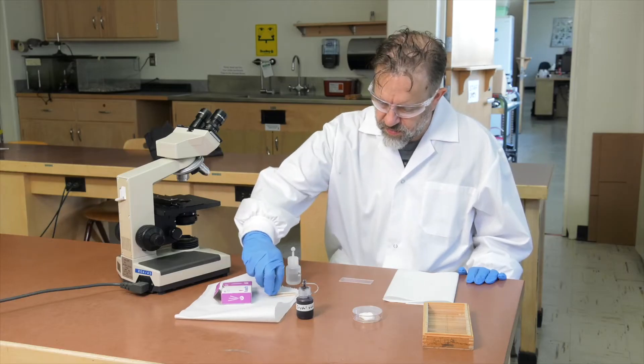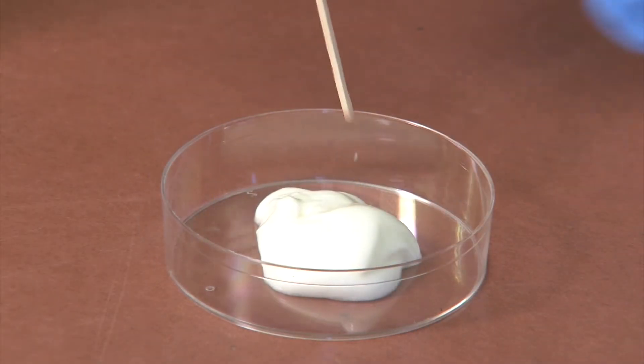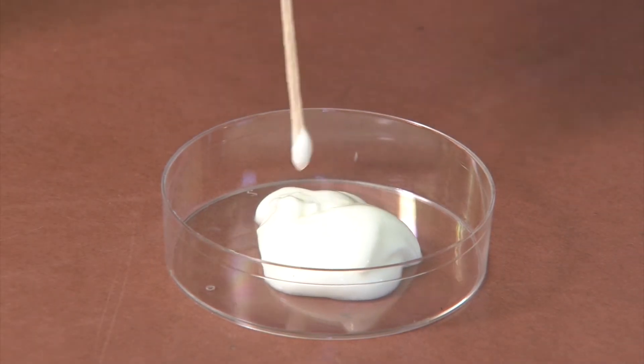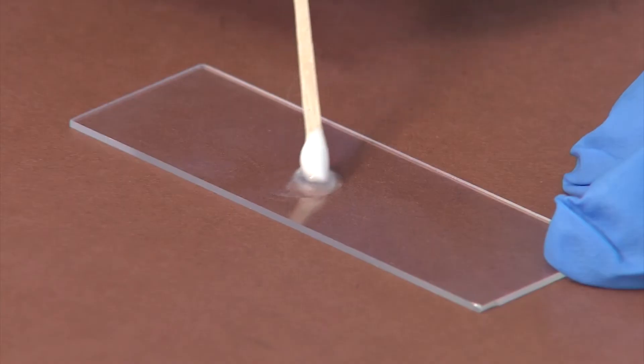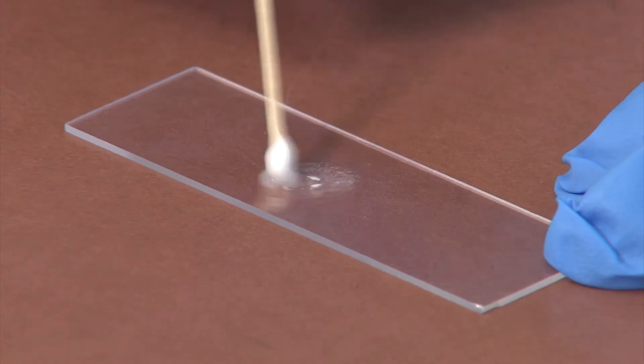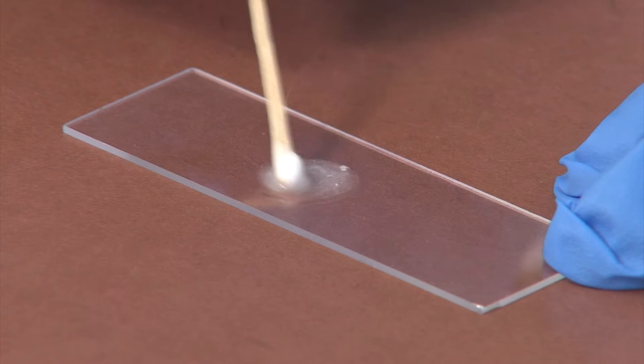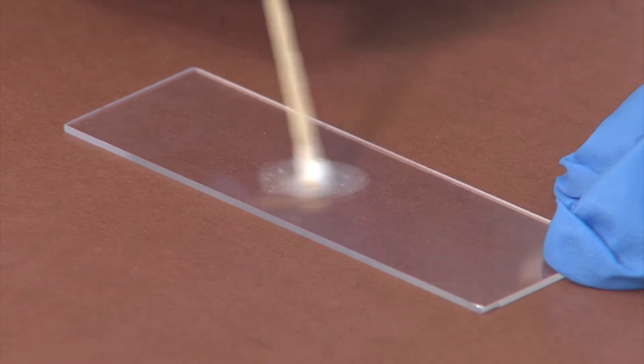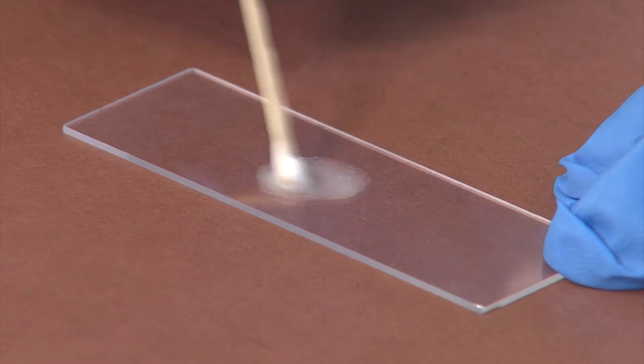Take a toothpick and dip the wider end in the yogurt, then smear a small amount in the middle of the water droplet. You should have a slightly cloudy drop of water. If there is too much yogurt, you may have trouble seeing bacteria.